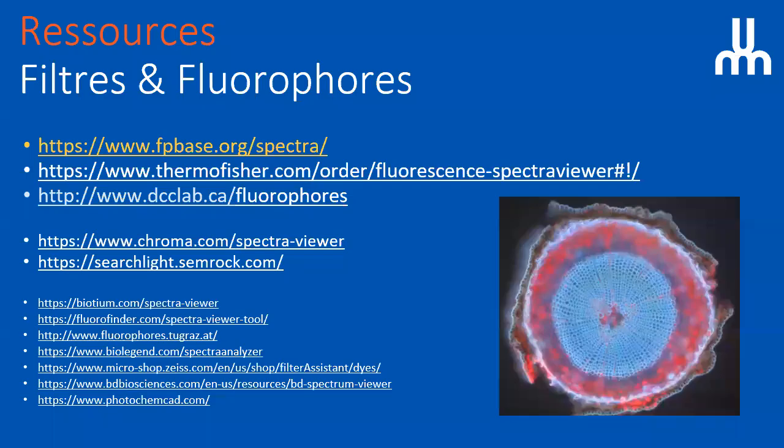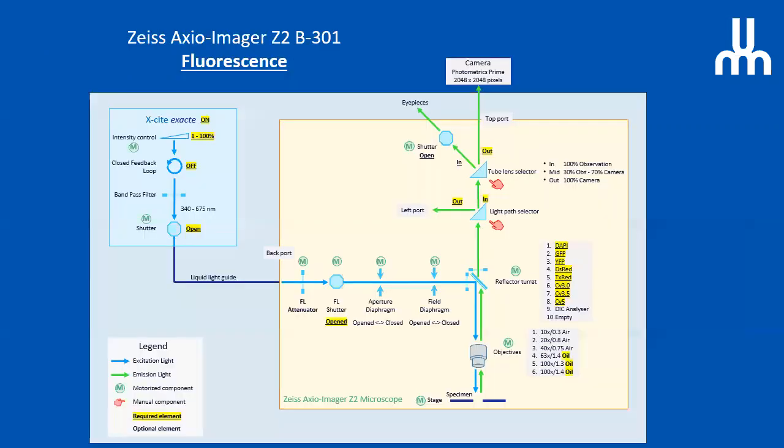Controlled on this computer. Done. Let's go back to the fluorescence. There. So these resources for fluorescence and filters, about spectra and things, are very important to check before.